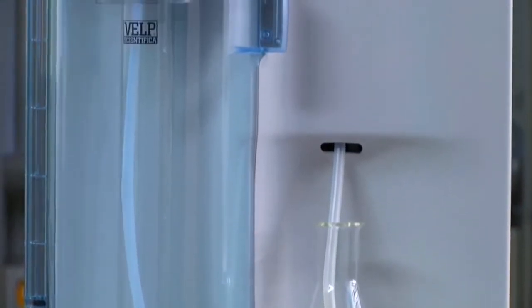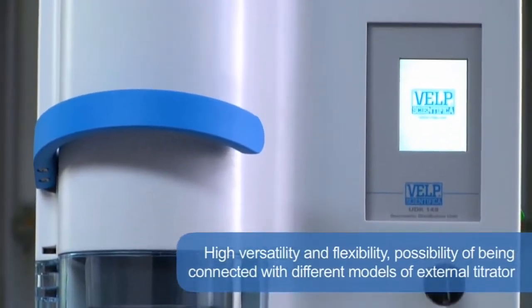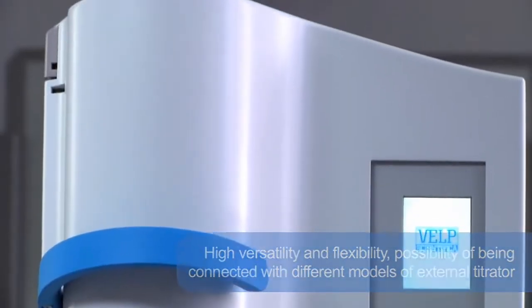The VELP UDK 149 offers the highest versatility and flexibility, thanks also to the possibility of being connected with different models of external titrator.